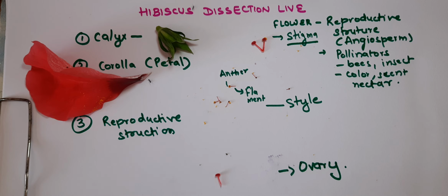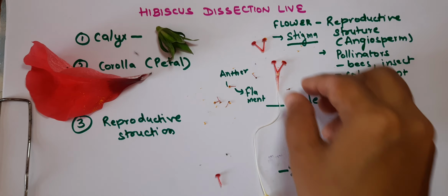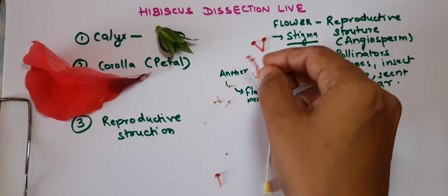Okay, so you can see the internal structure.